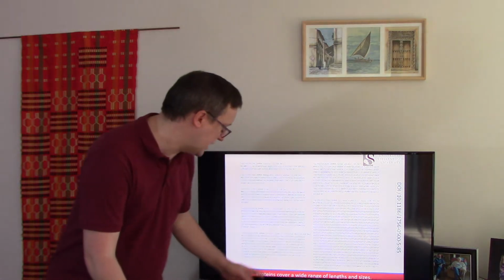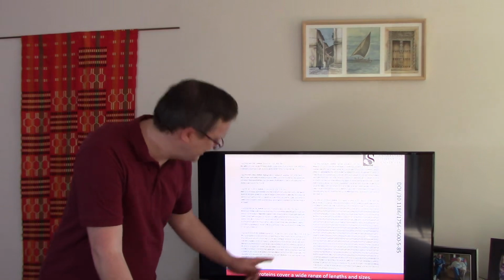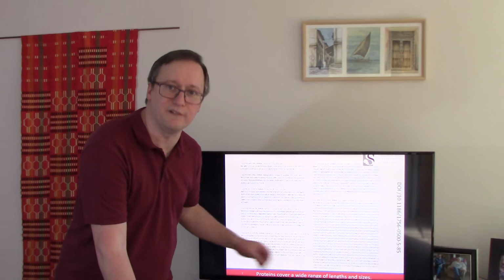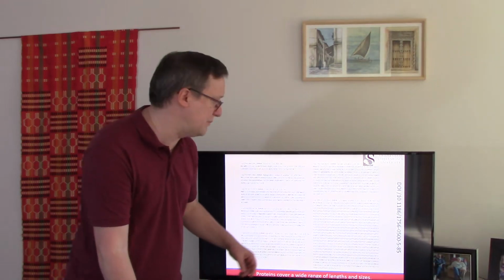Now, is that an unusually large protein? Definitely not. But if you're in the top-down space, as soon as you step beyond 50,000 Daltons, you'll frequently find that your ability to recover a decent sequence from it has diminished. So this boundary is changing a little higher and higher every year, but with current technologies, being in the 50 to 100,000 Dalton range is frequently problematic. Okay, so here we see that keratin, our old friend, is not that much bigger than actin, but it is enough bigger that identifying its sequence from top down may be problematic.